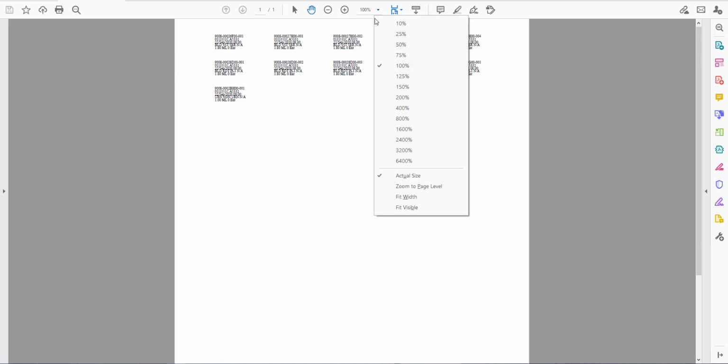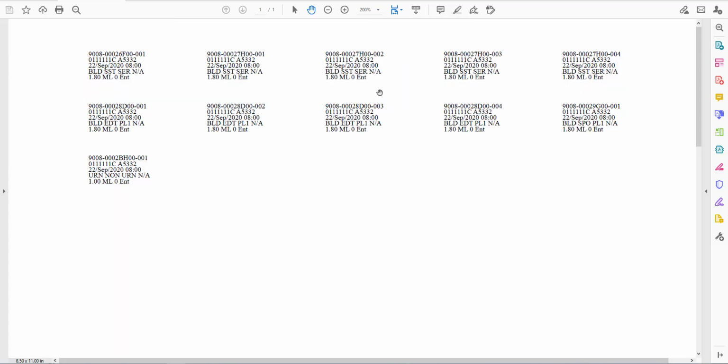If I go ahead and enlarge so we can review the content, at the top here I have my Global Specimen ID. Now that is the unique identifier that is issued by the LDMS for all of the samples in the database. We'll talk about that a little more in Specimen Management. My second line, I have my PID and my study, my collection dates and time. Then I have those sample abbreviations, so my primary, additive, derivative, and sub-additive derivative. The last line, I have my volume and volume unit, as well as my visit and visit unit.